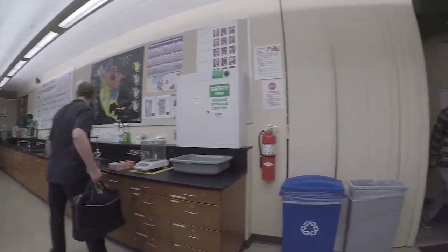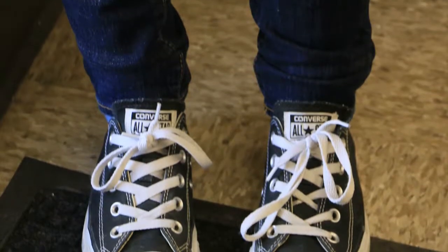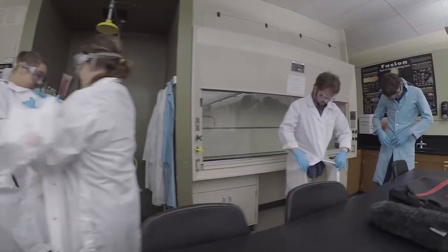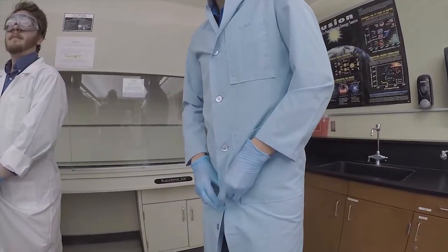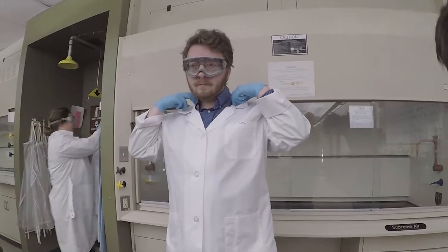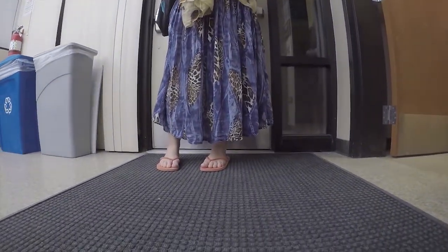On lab days, make a conscious effort to wear lab-appropriate attire. Wear closed-toed shoes, long pants, and long sleeves to protect your body from broken glass or any chemical spills. Lab coats provide a great protective barrier between you and harmful chemicals, making it easier to remove if a chemical does spill on you. Tie back any loose hair to prevent it from catching on fire or accidentally submerging into a chemical solution. Loose jewelry and baggy clothing are a potential hazard when working in the lab, as you can see.